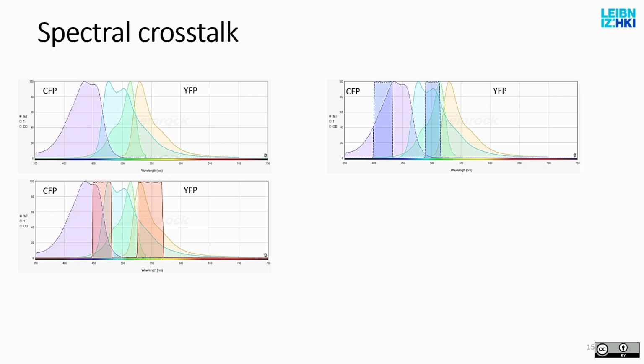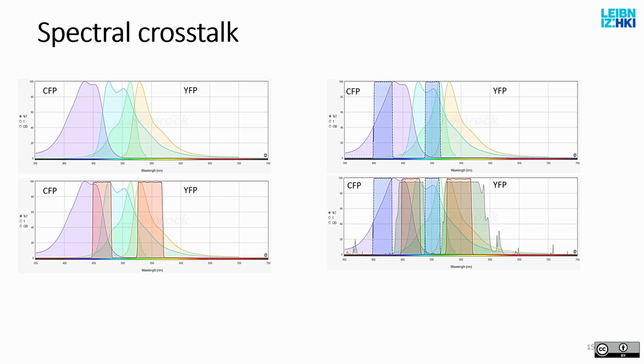So we have 2 options then to avoid this mess. One is, as I said, do control samples, and you all discussed very, very well. And with fixed samples, this is actually the way to go.